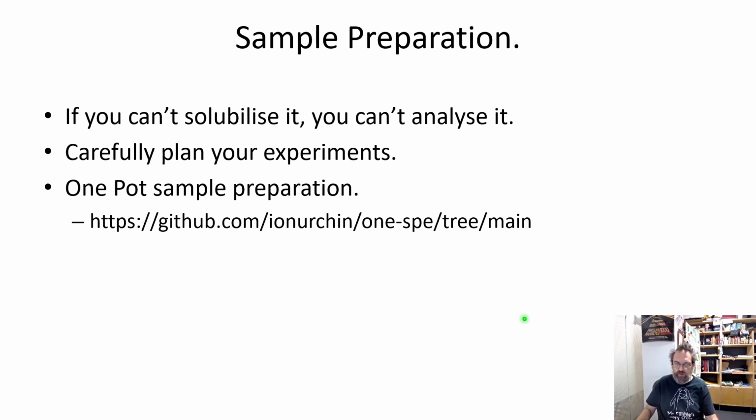I think the take-home message of this is that if you can't solubilize your protein, you're not going to be able to analyze it. You're not going to be able to fractionate it. You're not going to be able to collect all of the molecules of the same protein together to increase your sensitivity, because that's the most important thing. Proteomics is a concentration-sensitive technique. If you can't collect all of your proteoforms together in the smallest volume and therefore the smallest piece of space, you can't analyze them with the greatest amount of sensitivity.